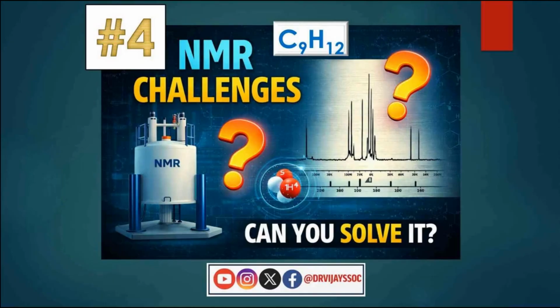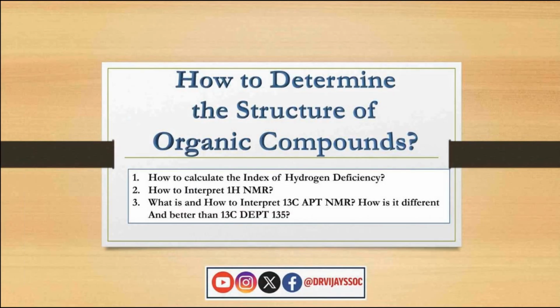This is our fourth NMR challenge. While determining the structure of this organic compound, we are going to follow all those steps which we learned in the last videos. First we will calculate the index of hydrogen deficiency, then we will look at 1H NMR, and after that we will look at 13C APT NMR.